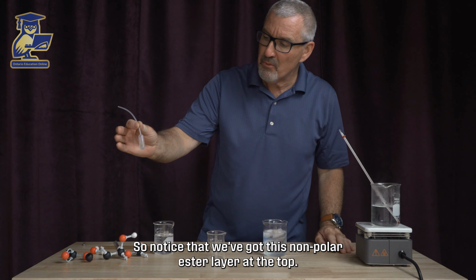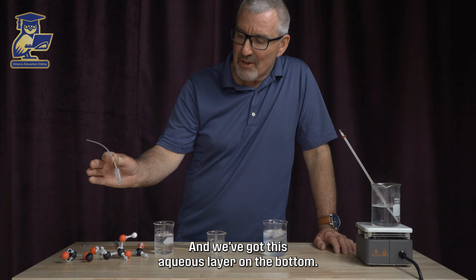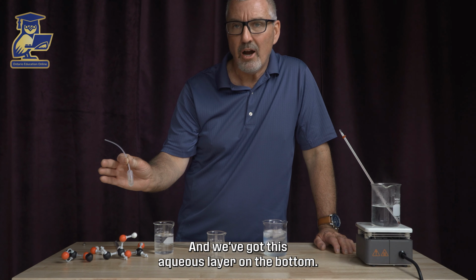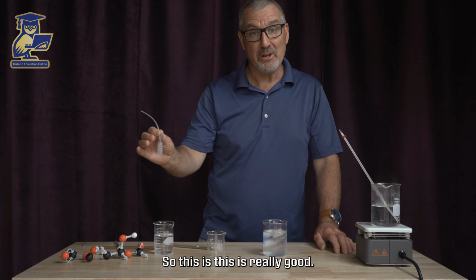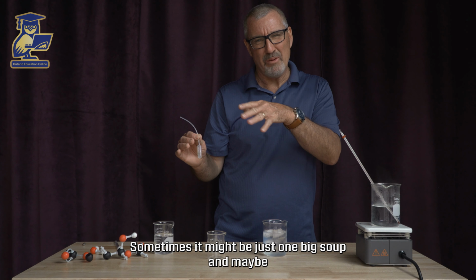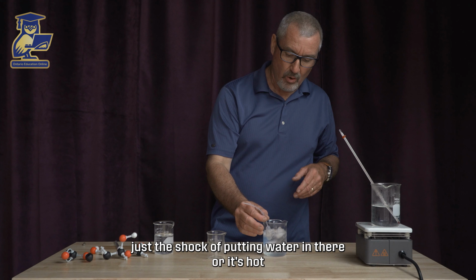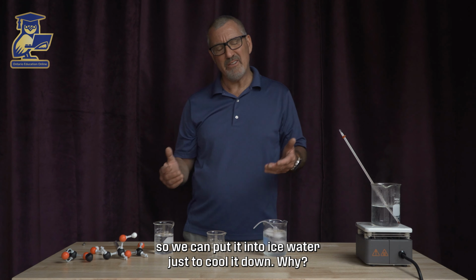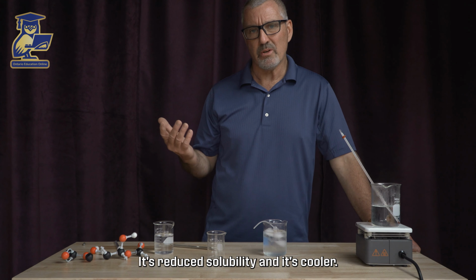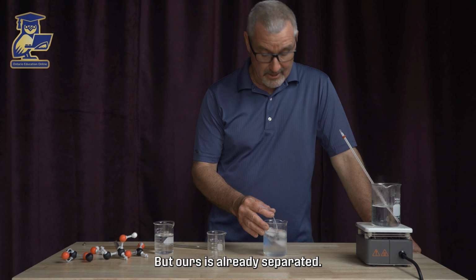All right, so notice that we've got this nonpolar ester layer at the top, and we've got this aqueous layer on the bottom. All right, so this is really good. Sometimes it might be just one big soup, and maybe just the shock of putting water in there, or it's hot, so we can put it into ice water just to cool it down. Why? Just reduce solubility. All right, it's cooler, it just doesn't dissolve as well. But ours is already separated.